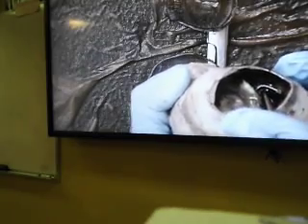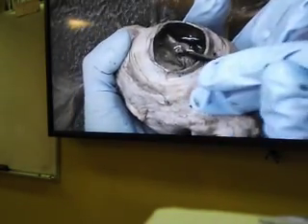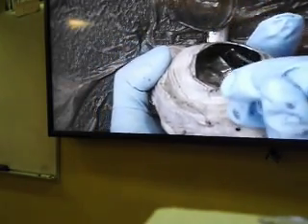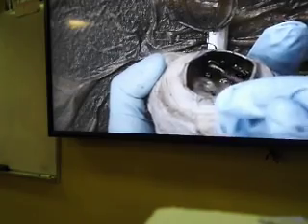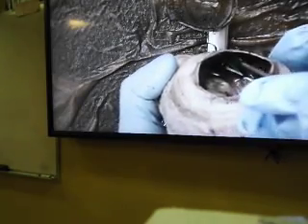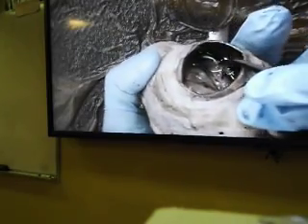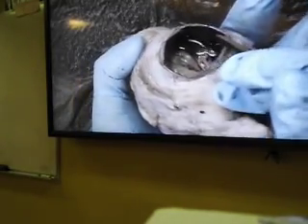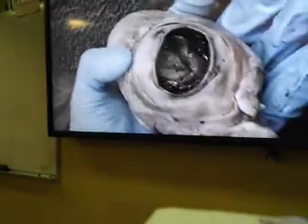And the choroid, as we said, most part of the choroid is black, and it also tells you that it's the middle layer, the choroid, in the vascular tunic. Now this bluish membrane that we see in the choroid of this cow eyeball is not present in us. This membrane which produces the bluish sheen is called tapetum fibrosum, and what it does is make animals like cow or sheep or dogs have their eyes glow at night time. Our eyes cannot do that, so our choroid will be simply black without any tapetum fibrosum.